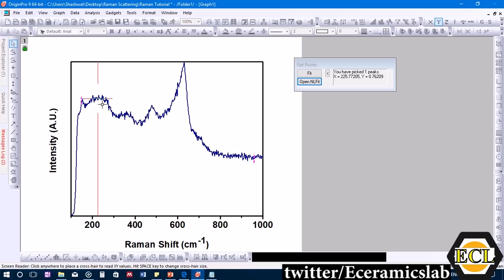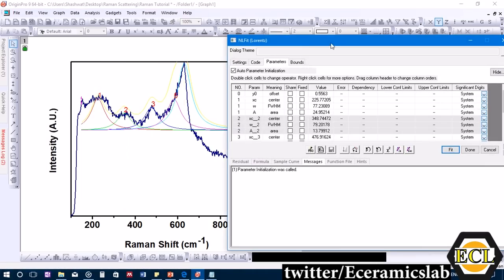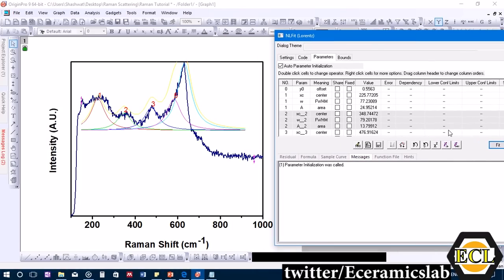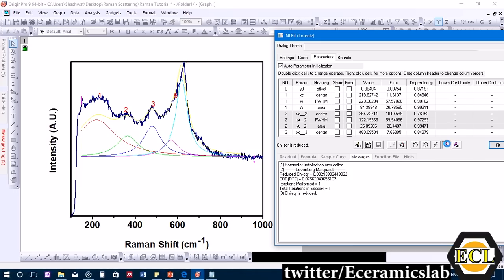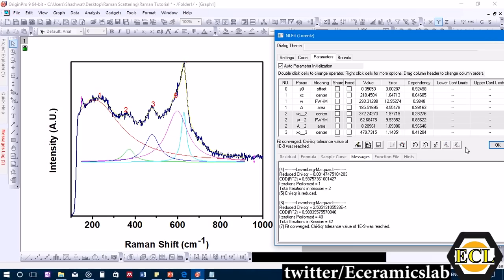This time we select only the correct peaks: one here, one here, one here, one here, and one down here — omitting the erroneous peak from before. We click 'Open' and fit again iteratively, then click 'Fit Until Converge.' The R² value is now 0.98, which is quite good and close to 1.